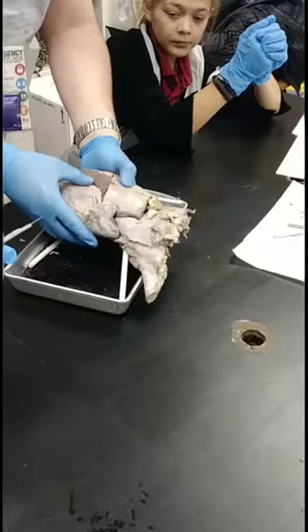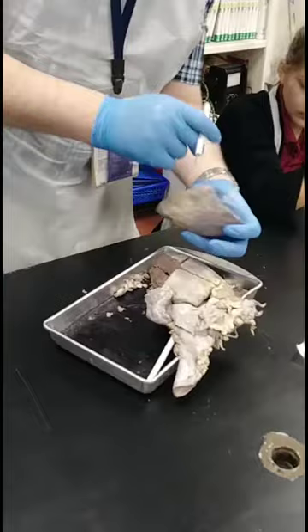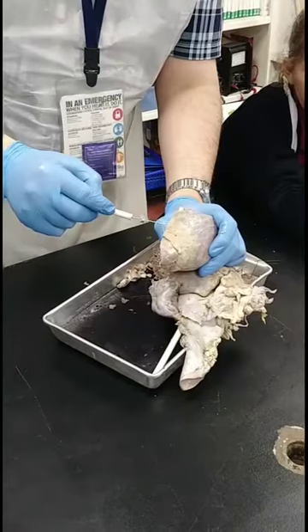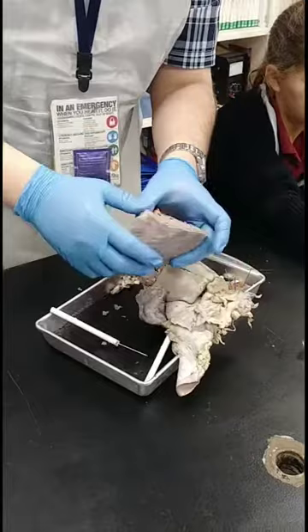See how thick that wall is? So the myocardial tissue is muscle. This thin little membrane on top, you see this white layer? See that? That's the inner part of the pericardial membrane. The heart will be covered in a big sac filled with fluid, and that part's gone, the rest of the pericardial sac. But you still have this membrane covering the rest of the heart, covering the muscle. Make sense? So that's that thin little layer there, just like the periosteum on those chicken wing bones. It's a thin little membrane.